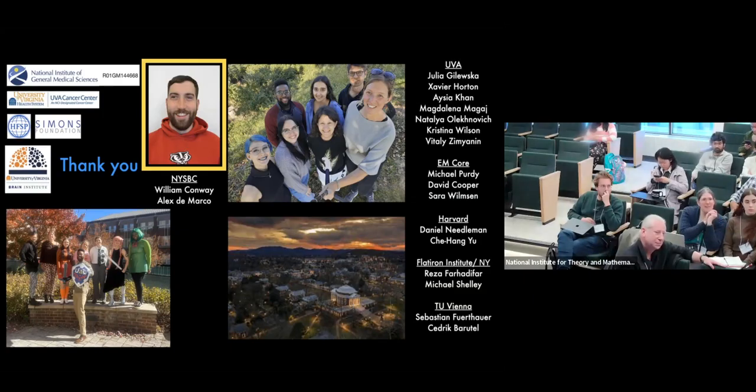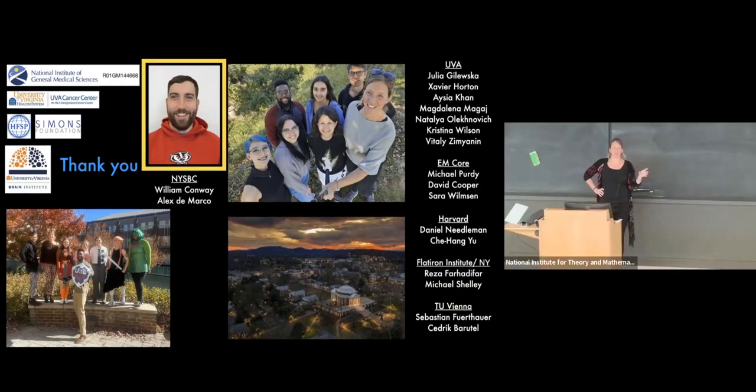And then the packing, when you did the double knockout, was smaller in your peak. It had 2 peaks, yeah. And then there is, Dick McIntosh did some larger scale reconstructions, but they are done in different ways. I think you could go back, and those are the first ones that did it in a new way. Because it is very labor intensive, not a lot of people do it. So what people often do is smaller areas, right? But you could get some packaging, I think, from this.